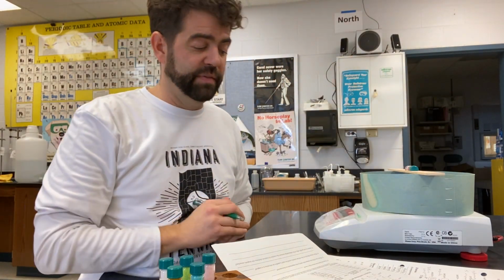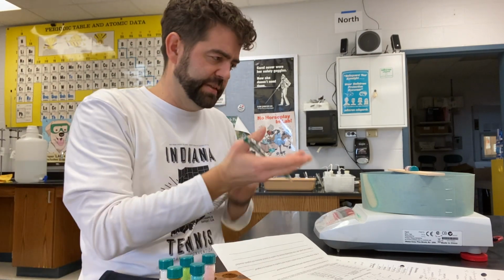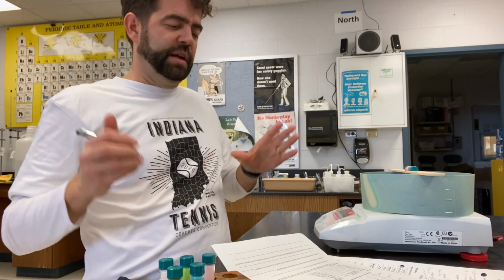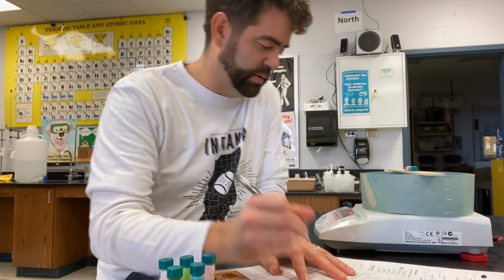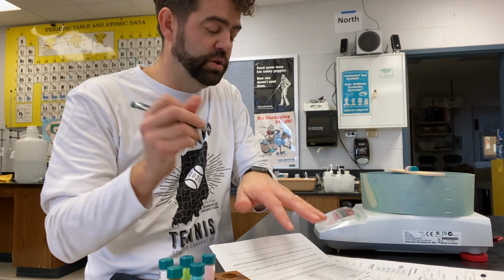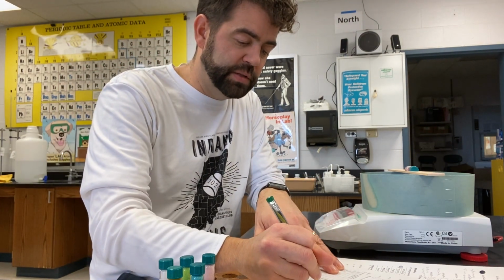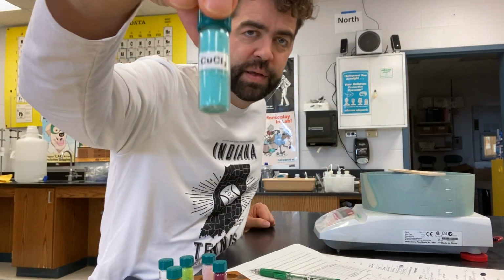Now, I'm gonna give you positive numbers just to keep it simple, and get rid of the negative. Obviously it's negative, it's pulling it up. But I'm just gonna give you the absolute value of the negative number. And my number is, oh, I'm leaning, don't do that, 0.22. Great.